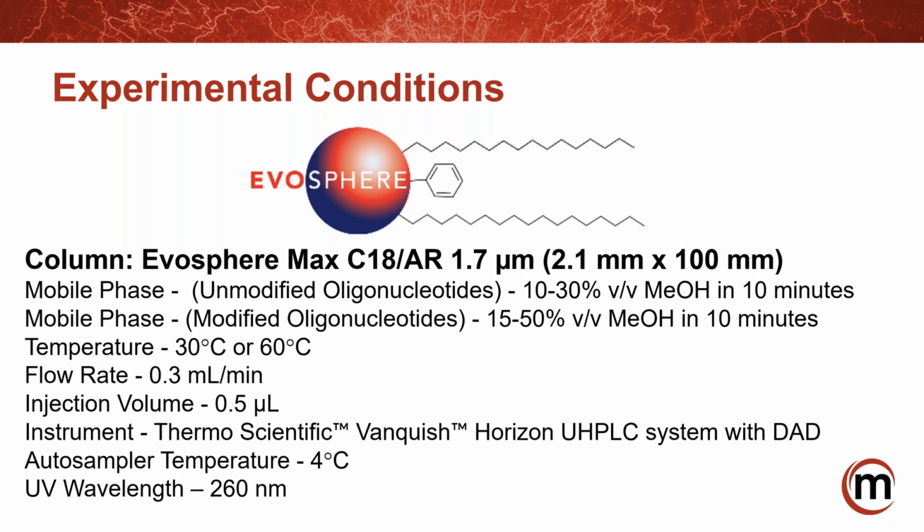In some of your slides, you mentioned you use ammonium acetate or ammonium formate, so they want to make this method compatible with LCMS. Is that correct? Yeah, that was the goal, because there are other key impurities they're looking for when they're running these.